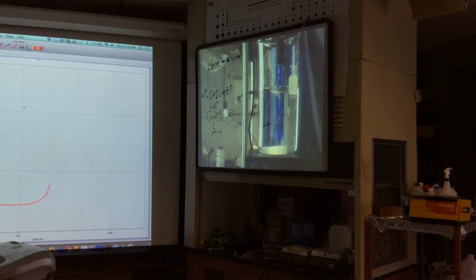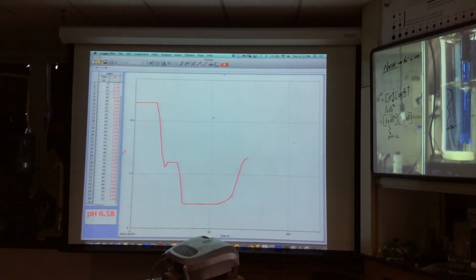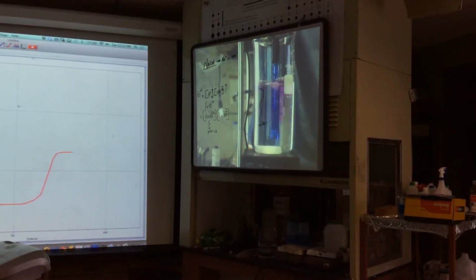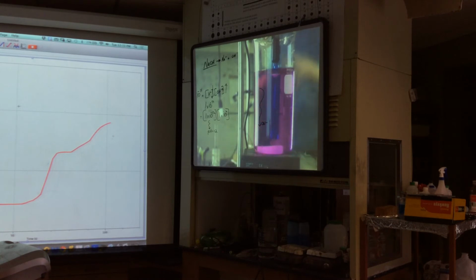Why? Right. When I pour this, the base, the phenolphthalein sees the base, right? But then the acid neutralizes the base. It's called a titration. But eventually, I'm going to get to the basic range and it's going to stay pink. And I'm there, in a basic range. So indicators help us decide whether something is basic or neutral. Add some acid. What happens to my color?